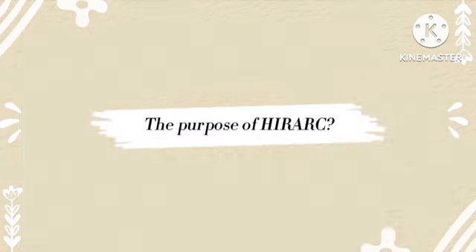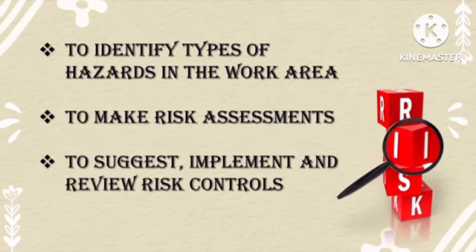to a hazard. The purpose of HIRARC: to identify types of hazards in the work area, to make risk assessments, to suggest, implement, and review risk control.